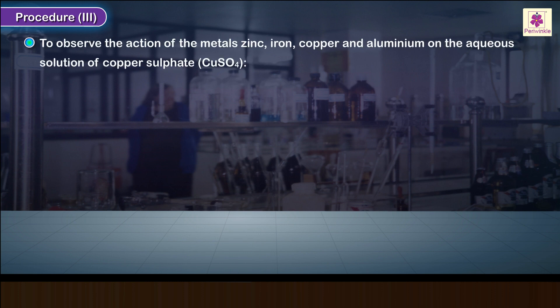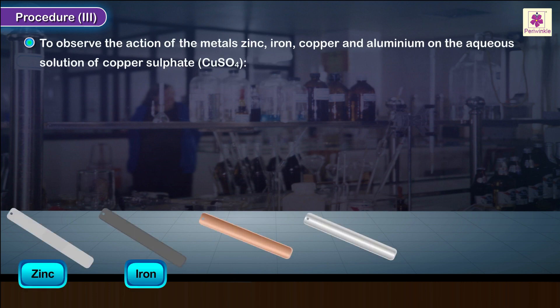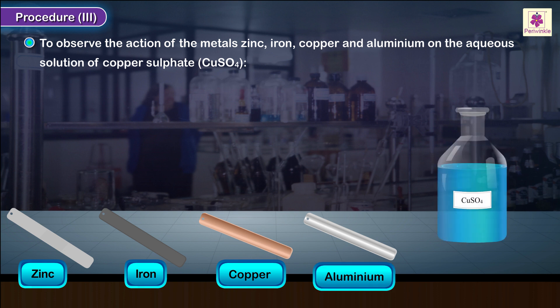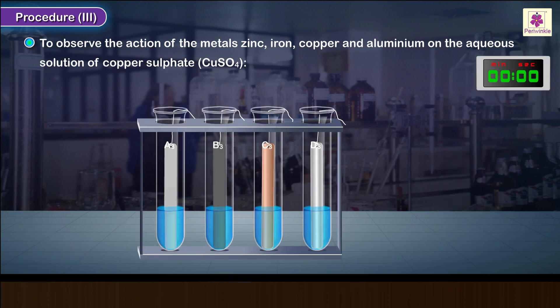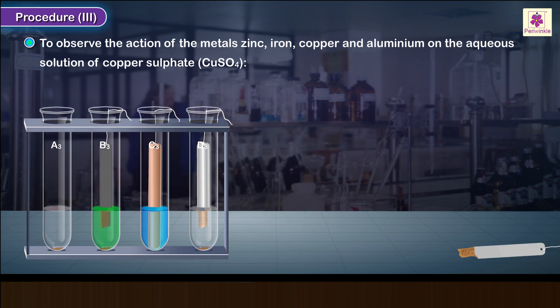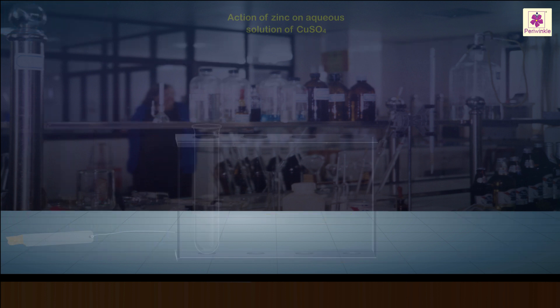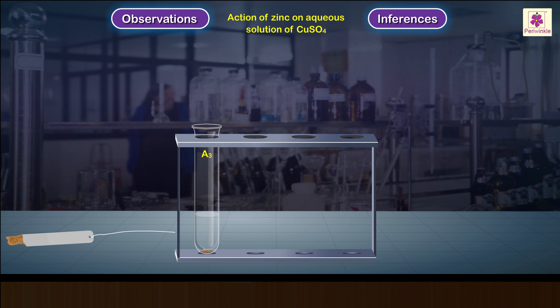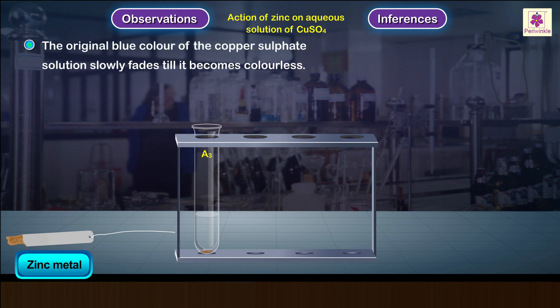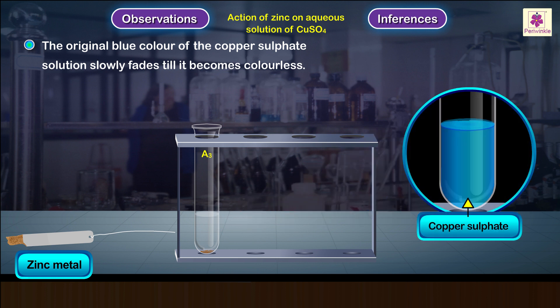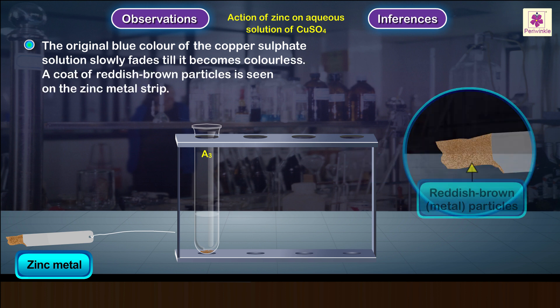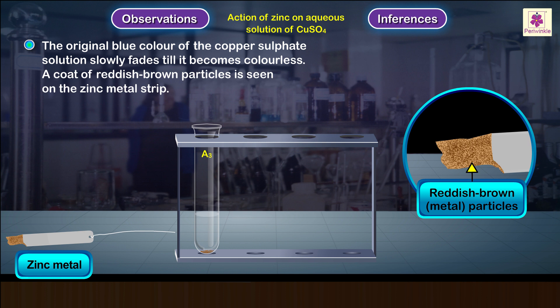Procedure 3: To observe the action of the metals zinc, iron, copper, and aluminum on the aqueous solution of copper sulfate. Repeat Procedure 1 with aqueous solution of copper sulfate instead of zinc sulfate. Carefully pull out each metal strip and observe the surface. Test tube A3 containing zinc metal: the original blue color of the copper sulfate solution slowly fades until it becomes colorless. A coat of reddish-brown particles is seen on the zinc metal strip. Zinc reacts with the copper sulfate solution.